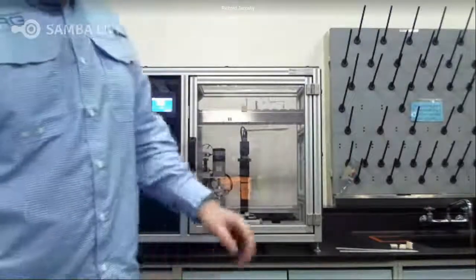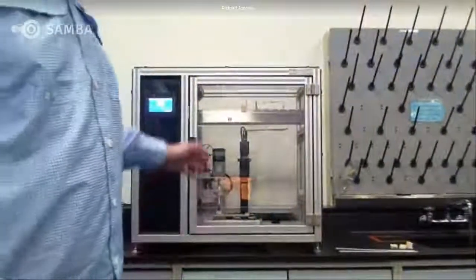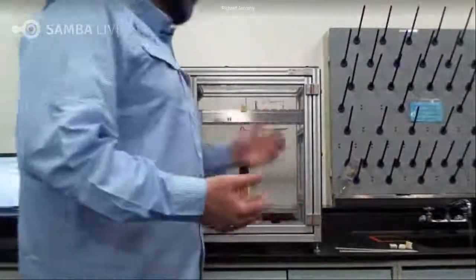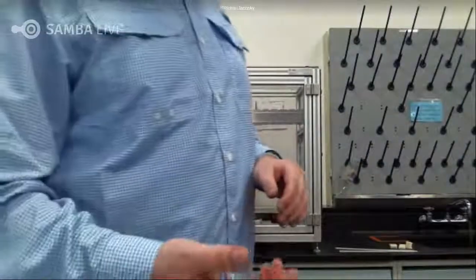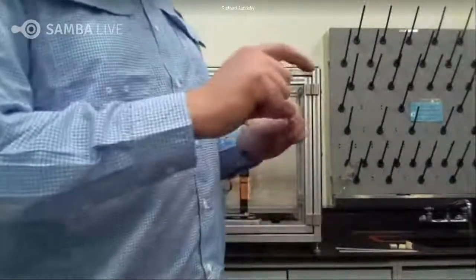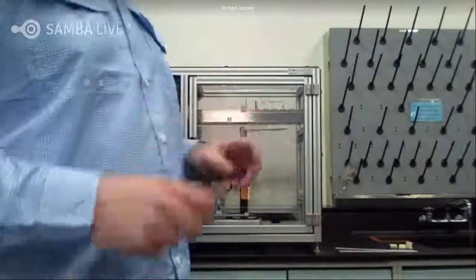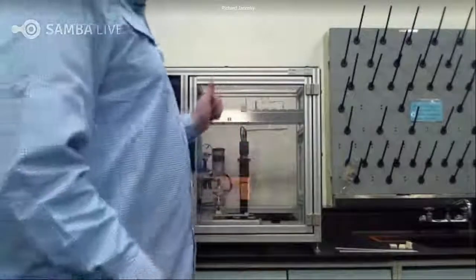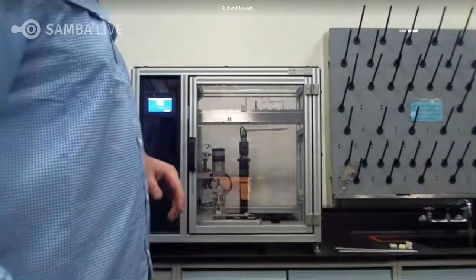The HMI screen software now has a pause button. So during extrusion, if you notice a sample or something just seems odd, or if you notice, as the standard mentions, that you should watch the force reading on the screen start to go up, this would allow you to pause the sample, fix it, and then continue on its way down the extrusion process.